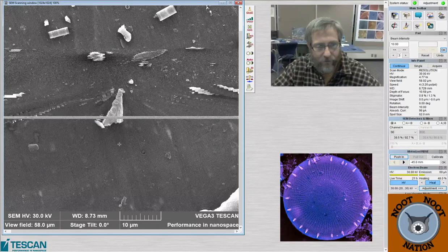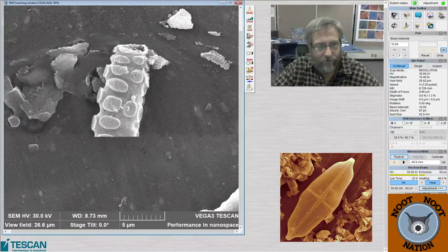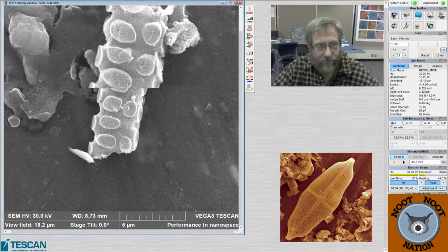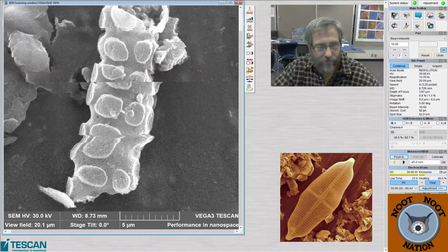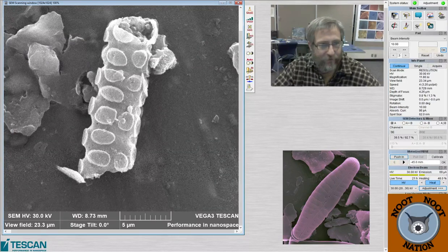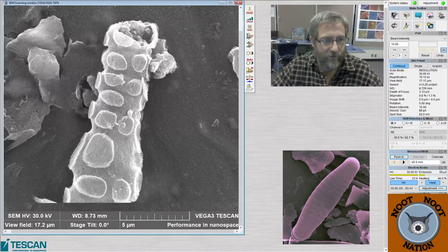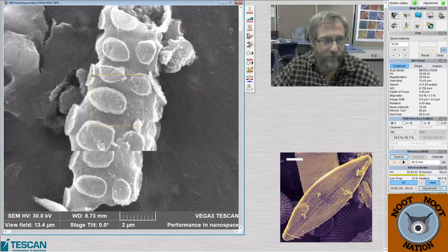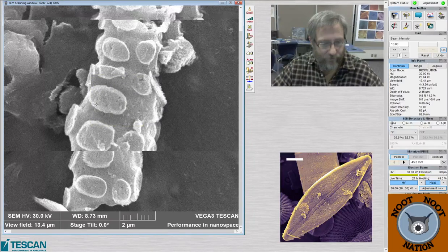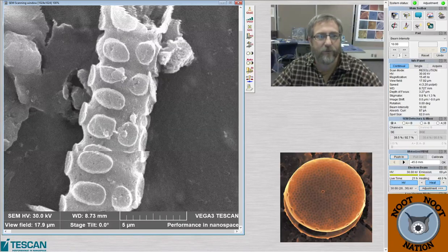Big stack. Oh, it's a phytolith. I'm gonna take this picture for Chad. This would be a good sample for his class to look at, because there's a bunch of diatoms and phytoliths and chrysophytes in it. Plus it's already prepared. It looks like a little tiny octopus tentacle.